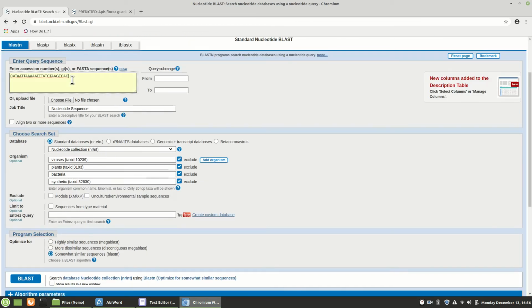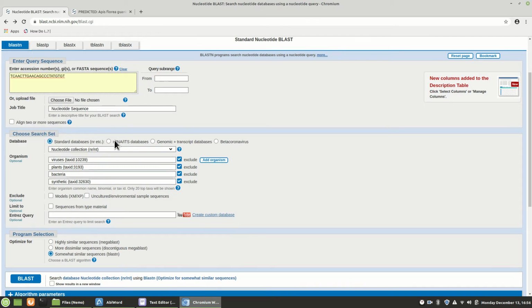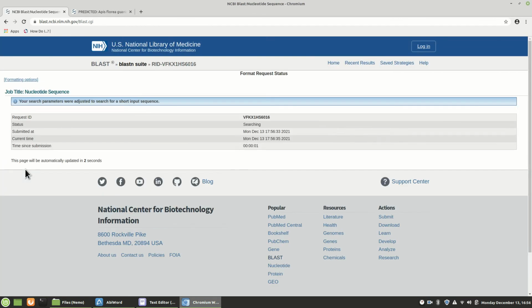We're going to erase this one. All right. And I'm going to put in this piece from NSP1. All right, we'll run it with the exact same parameters, and we'll see if we get anything. And hopefully it doesn't take forever to search. Now, knowing that this is NSP1 should help us.